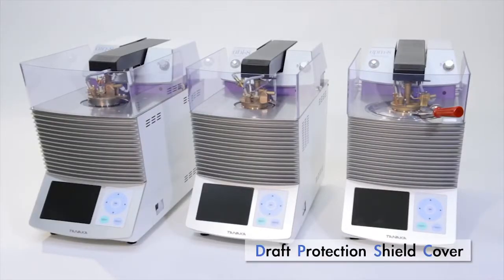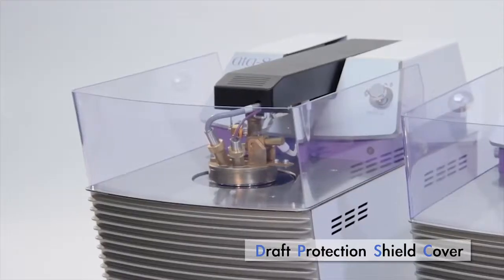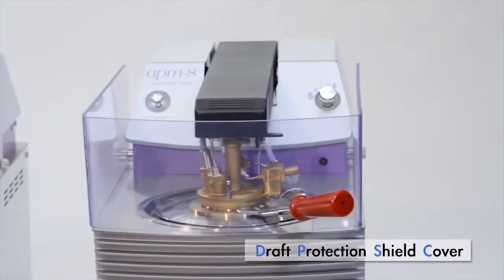For all models except the AC08, fire-resistant draft protection shield covers ensure test flame integrity.